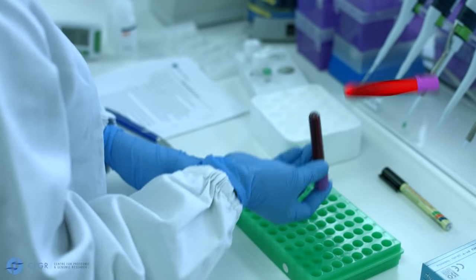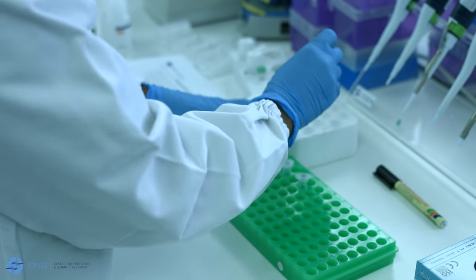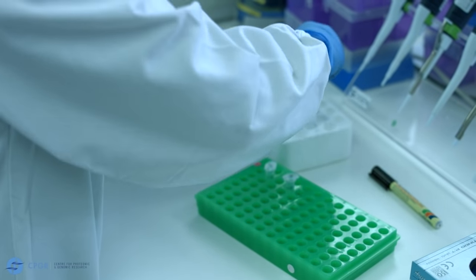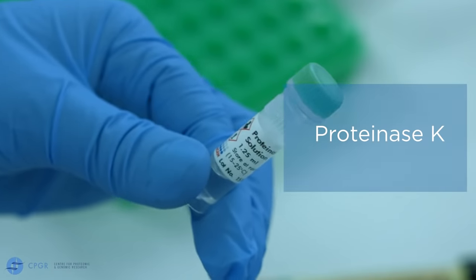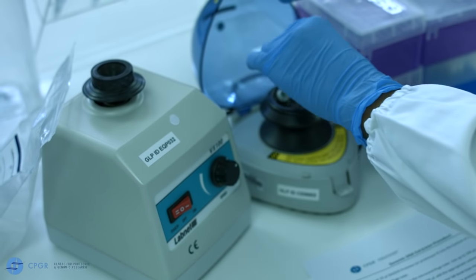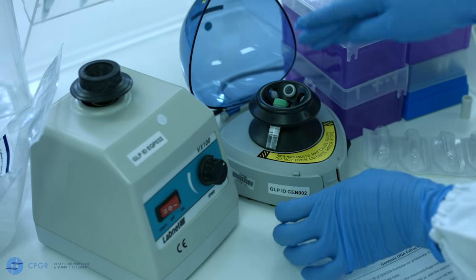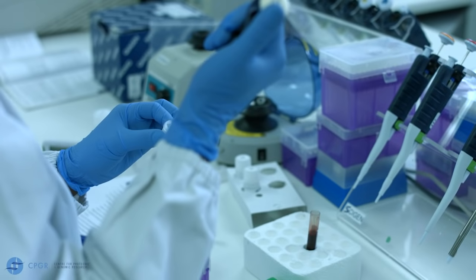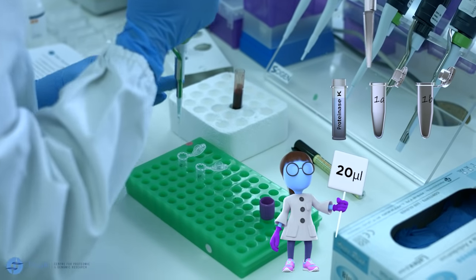Mix the blood by inverting the tube approximately 10 times to ensure you have a homogenous sample. Vortex the proteinase K briefly followed by a quick centrifugation step approximately 10 seconds.